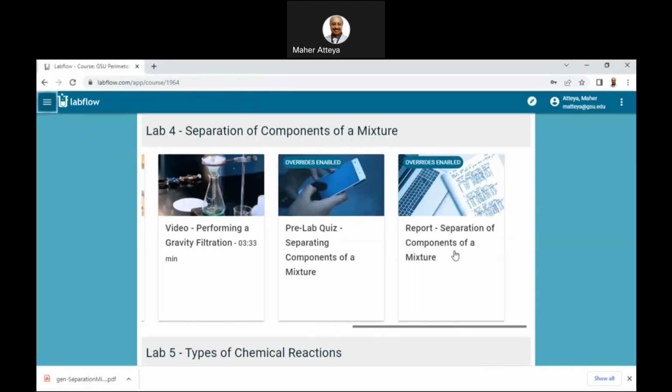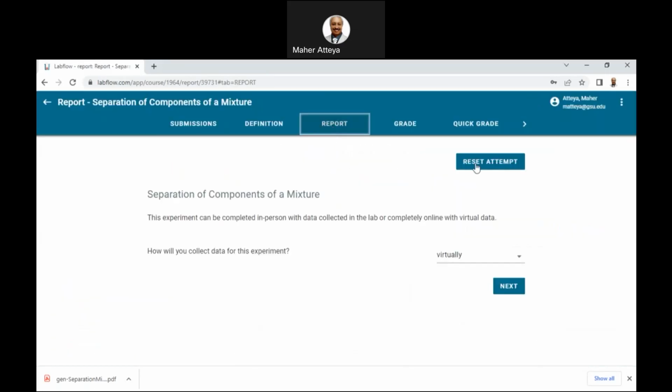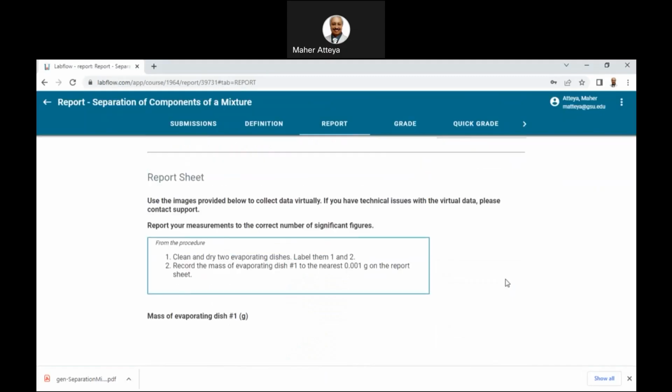So when I did fix it, it went all the way from the beginning. It cleans the label, and now it's giving me the whole information that I didn't have before. It said clean up and dry. I did not have this before. So this is the beginning of that. I think that's where the error came from.